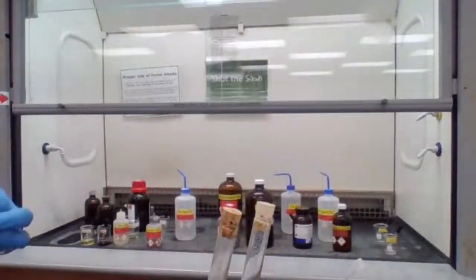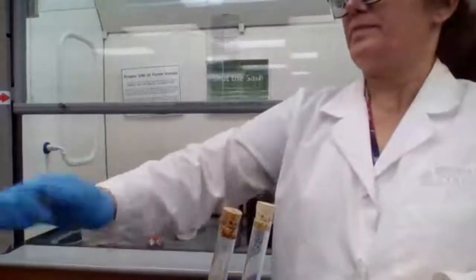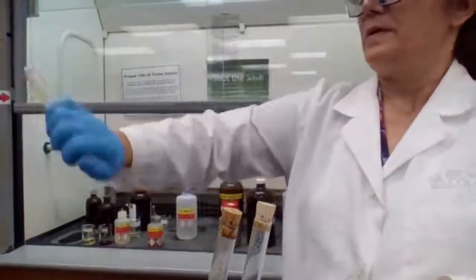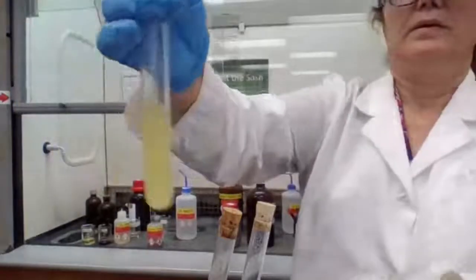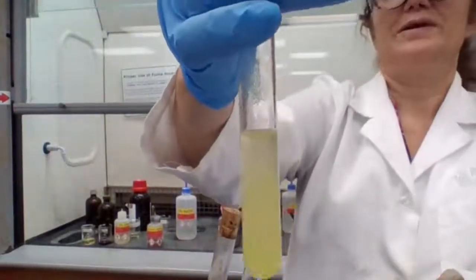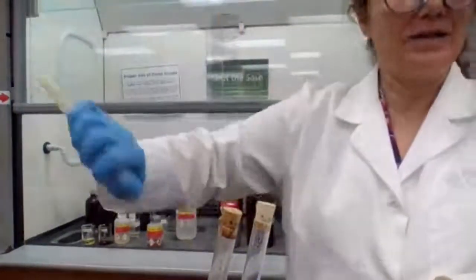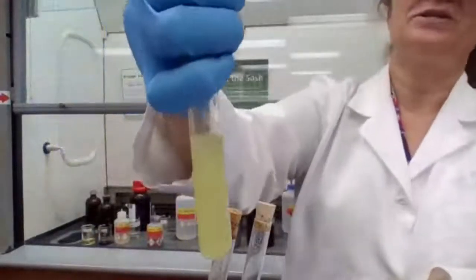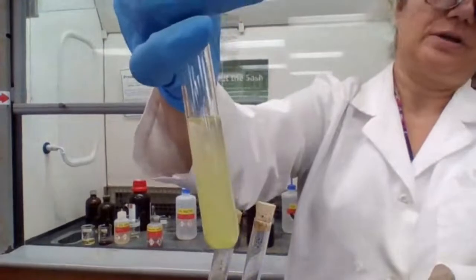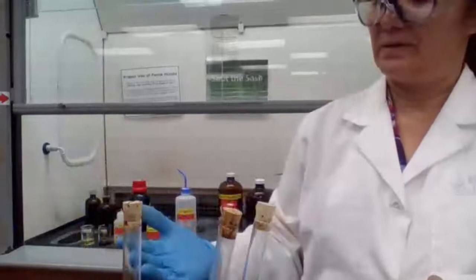Mix it well. Let me get a stopper. Mix. If it goes to one layer, it's tertiary. So now it looks like the primary that we had before, right? It goes to one layer. It doesn't say clear, it doesn't say dissolve, but if it goes to one layer when you add HCl, then it's tertiary. And that's about the Hinsberg test.